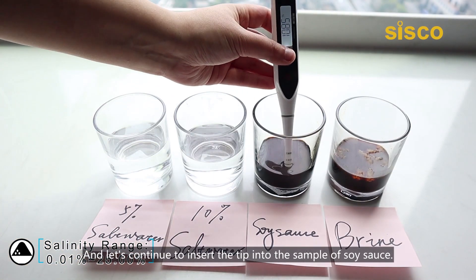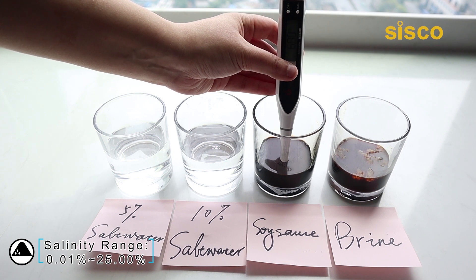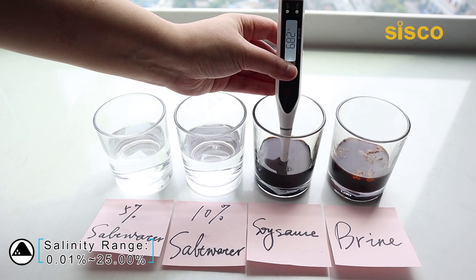And let's continue to insert the tip into the sample of soy sauce. You get a stable reading within seconds. It's very easy to read with the backlight. The result, as shown, is 6.82%.